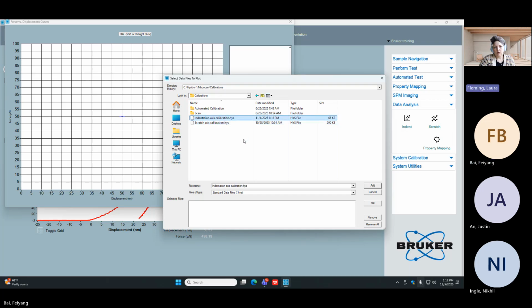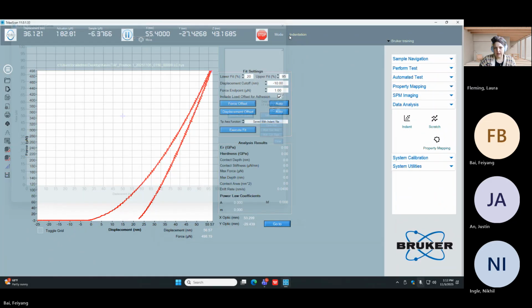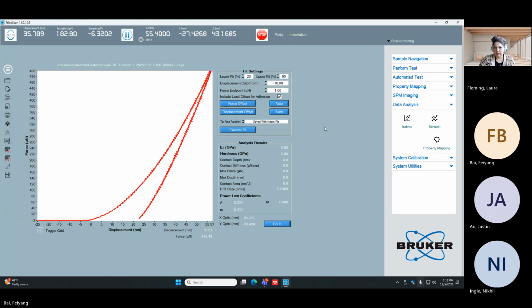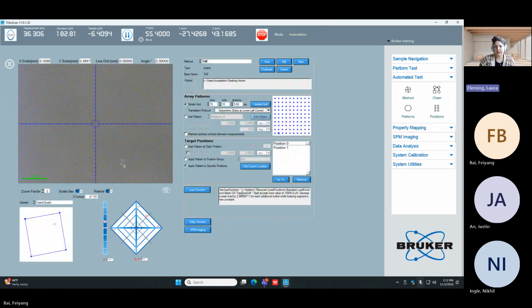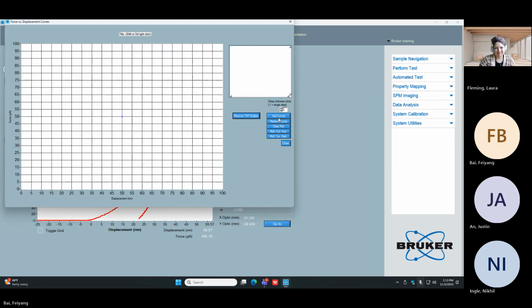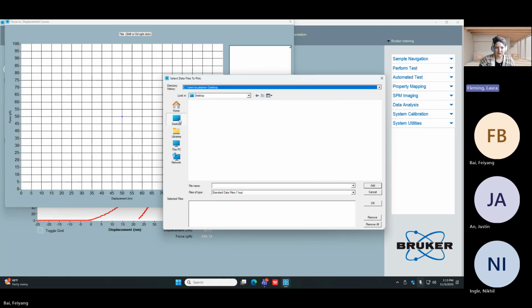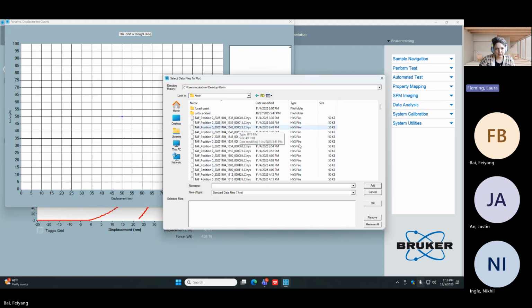This one? Nope. So yesterday, go ahead and close this. And close this. And go back to method automation. Sorry, automated test here. In that top part, that's where you save that data. That's what I'm looking for. Yes, okay. I don't know if it lets you copy and paste. This is a very old interface. Well, it's new, but built on old.